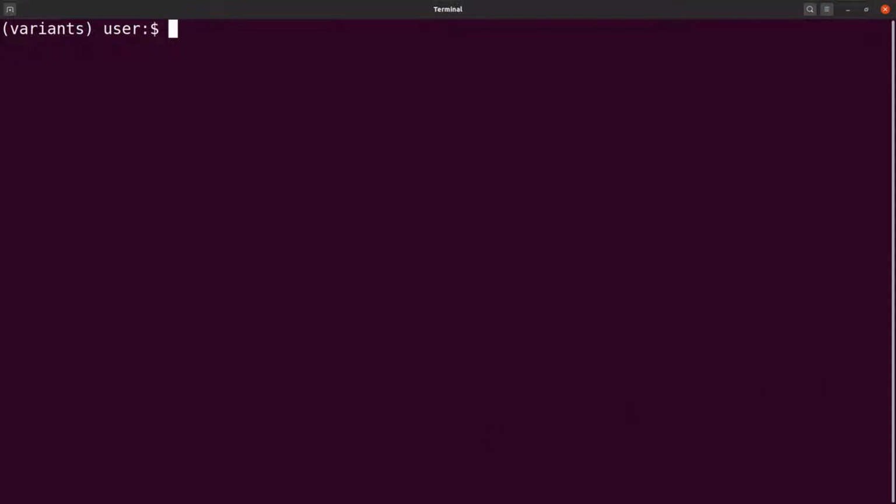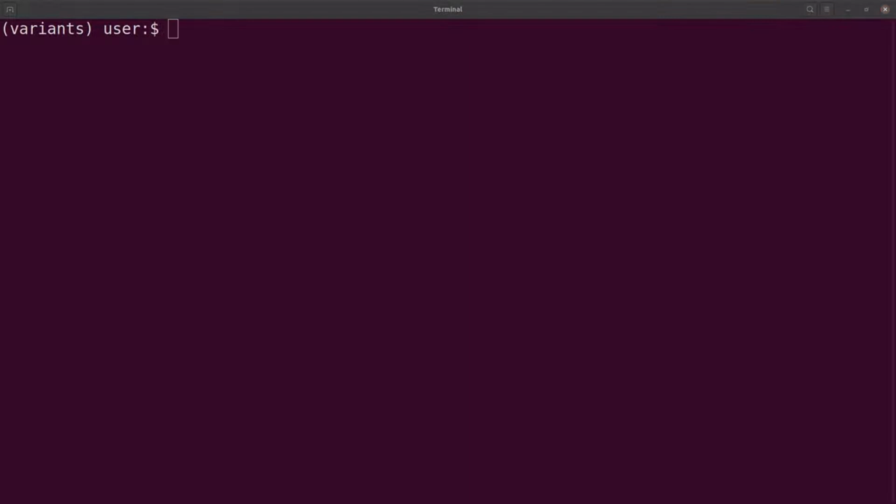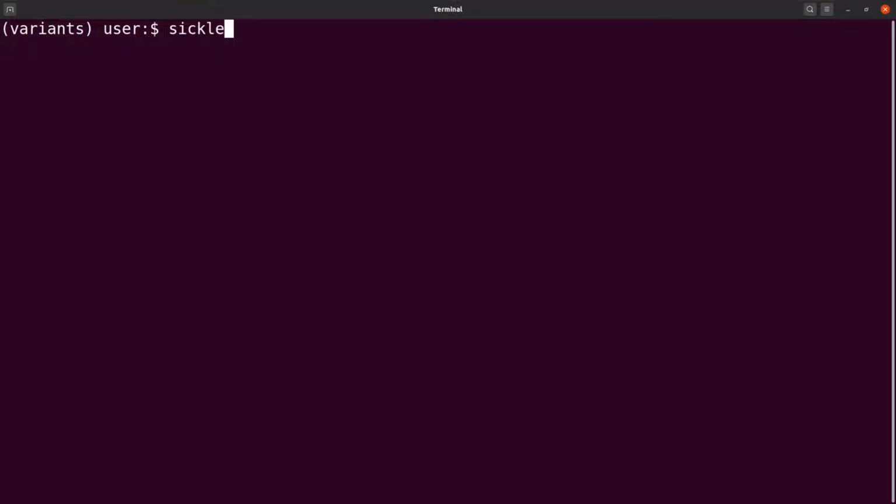So we will trim the reads. That's how we are going to do it. Let's type sickle first, and then let's type PE. And then we will indicate the forward reads with -f. So the name is P7741R1. That is read 1.